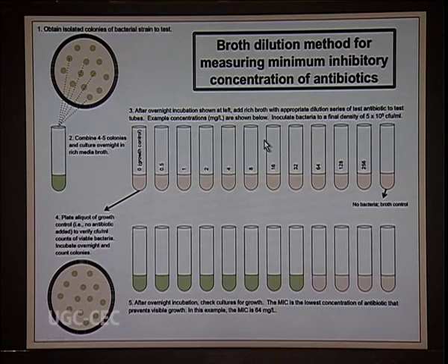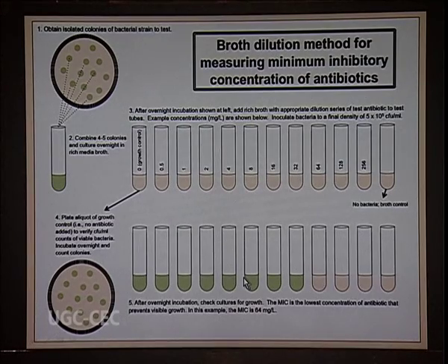In case of agar, we can use Müller-Hinton agar, and one specific microorganism, like penicillin can be given against gram-positive one. So from here, we can observe in broth dilution method, different concentrations of antibiotic are given and we can calculate the MIC. But in case of MIC, that will permit once again the growth in the fresh medium without antibiotic and help us to calculate or quantify the MBC.